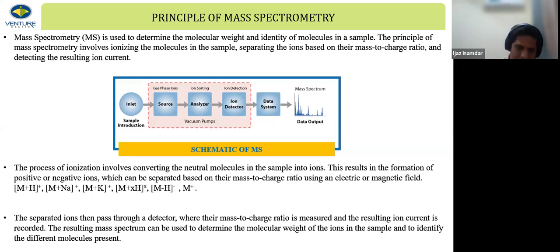This is one important point. People ask, generally freshers, what kind of molecules or species you generally detect in a mass spec, and is it a universal technique or not? So these are some small pointers there.